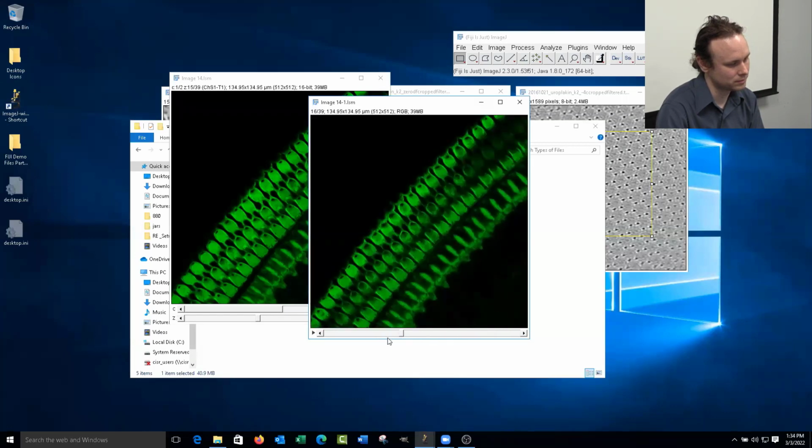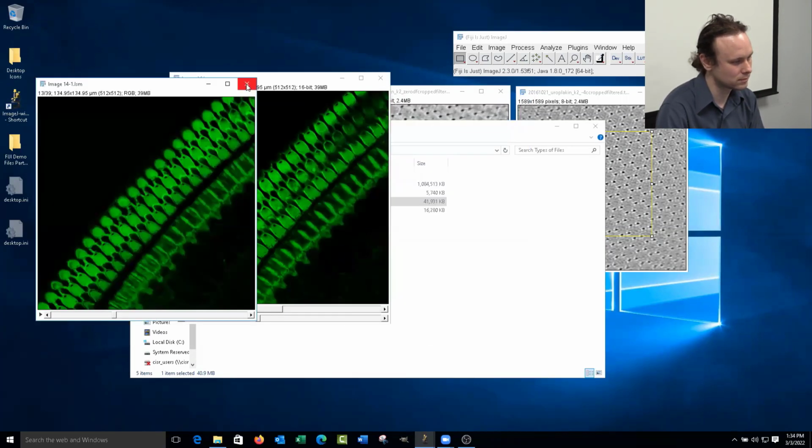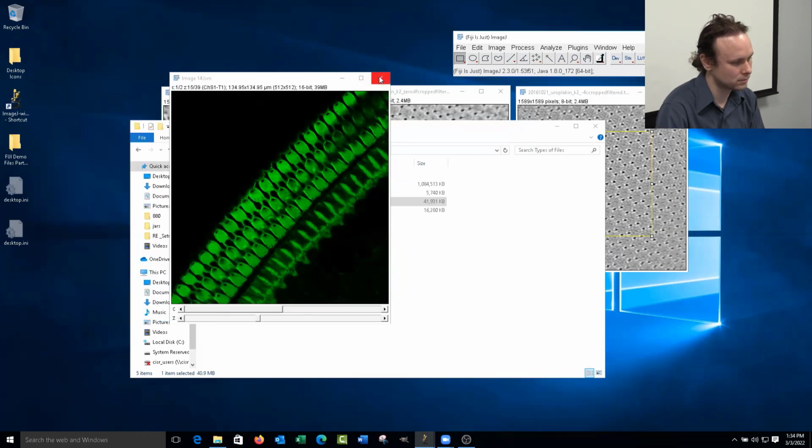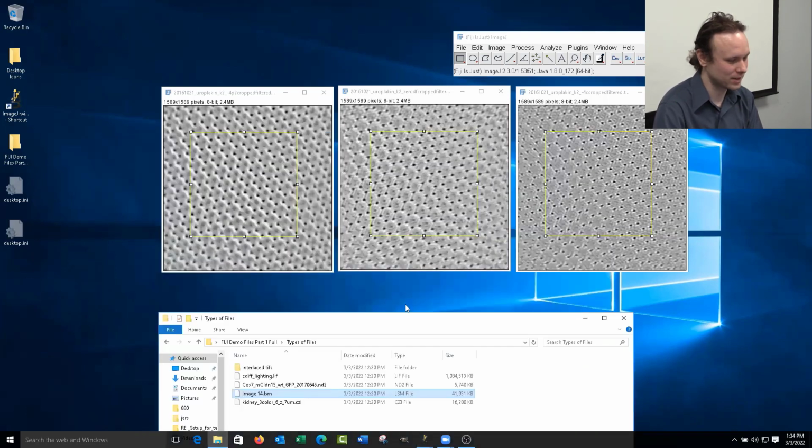And I do have a question on the topic that we're on right now. I'm still not super sure about where to click and then to click back. So how does FIJI know which selection it is pulling, or is it mapping from into another image, right? It'll be the last kind of box you've interacted with. So whatever the last box was.